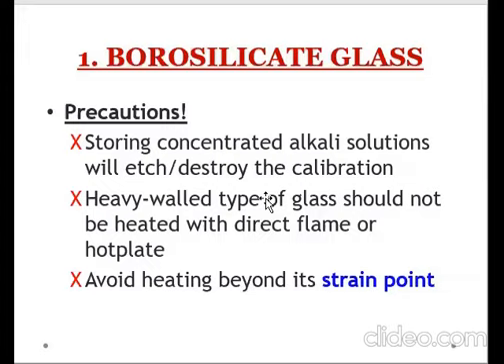Okay? So, for example, makapal yung glass. Nagpainit ka. So, mainit na yung entire heavy wall ng glass. Okay? And then, bigla mong tinanggal sa flame, and then naka-aircon yung laboratory room. So ano mangyayari dyan?